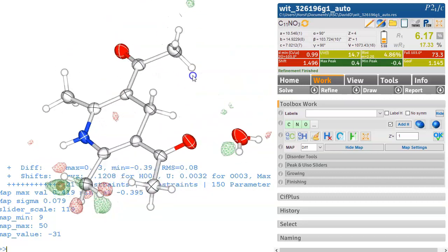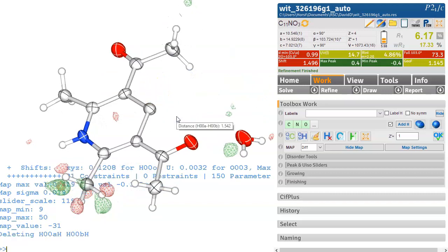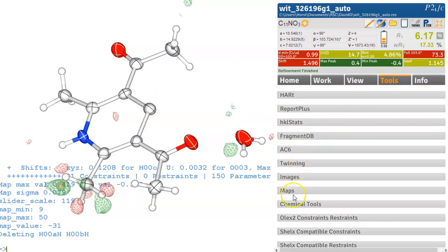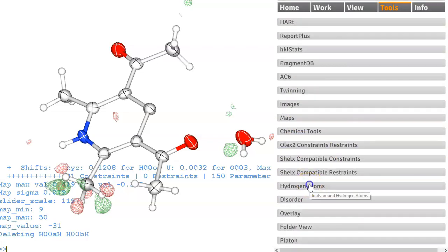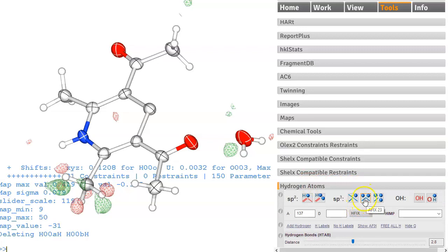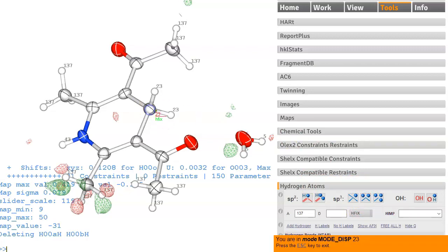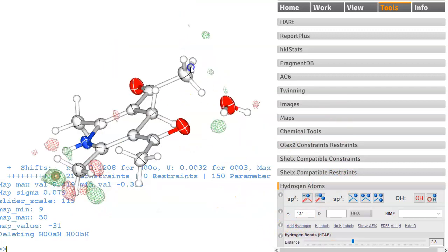Now these are now freely refined if you want to constrain them then you need to head over to tools and somewhere down there is the hydrogen atoms and you can pick the sort of CH2 that's the arrangement you want you select that and click on that and that adds those hydrogens that's coded with a AFIX 23 you don't need to necessarily know what that is but this is a code that tells the refinement program how to deal with those hydrogens so they are riding on that carbon they're taking all the parameters from that carbon. Okay Olex2 is in a mode this is why there's an orange box we can hit the escape key to get out of that.